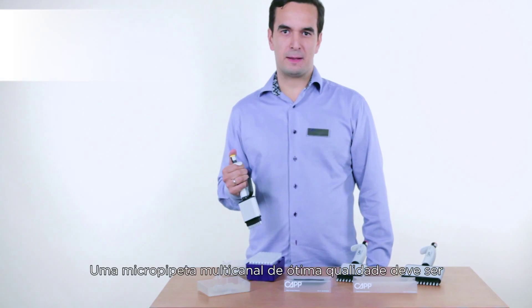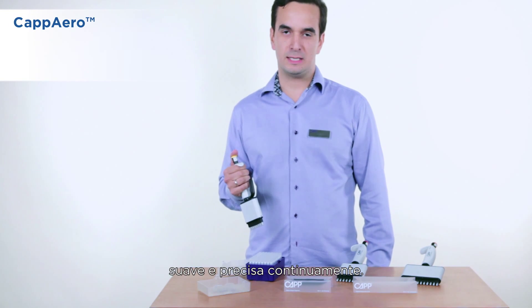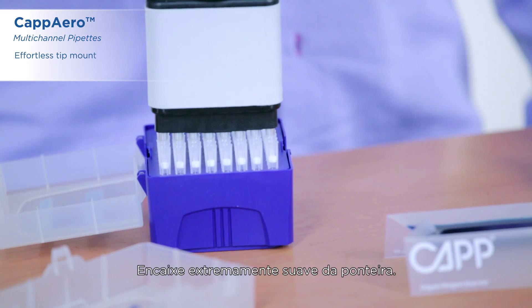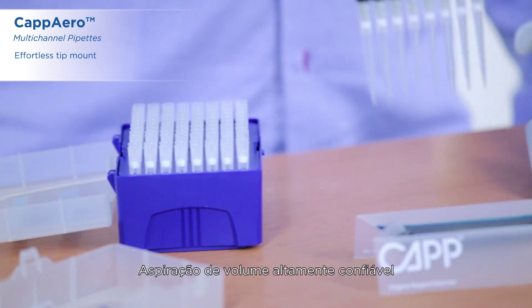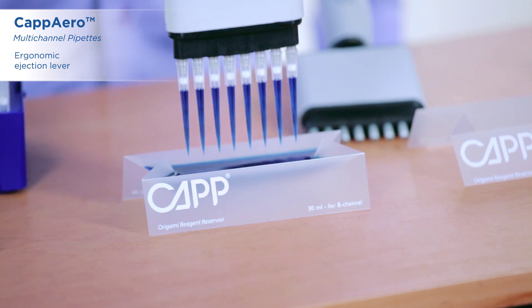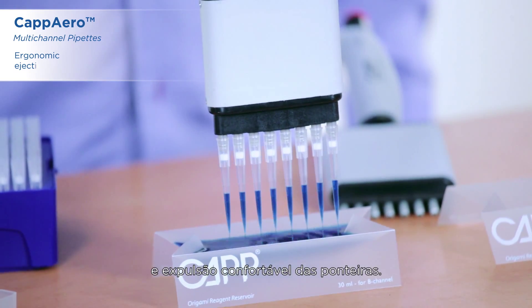A good quality multichannel pipette has to be smooth and accurate continuously. Check this out. Very smooth tip mount, reliable volume aspiration, and comfortable tip ejection.